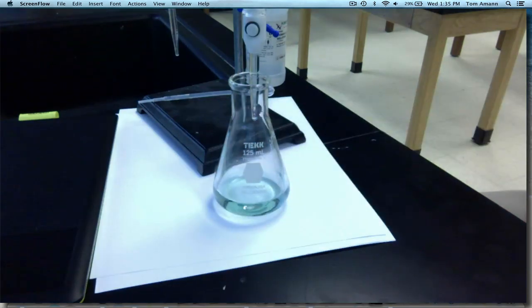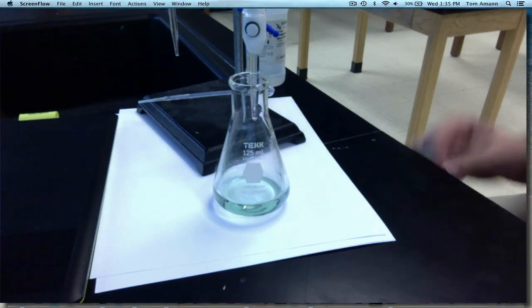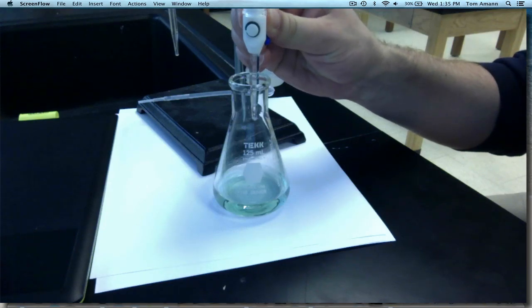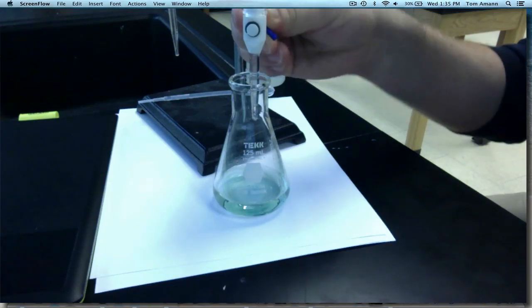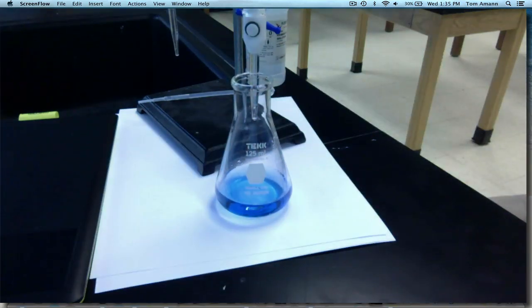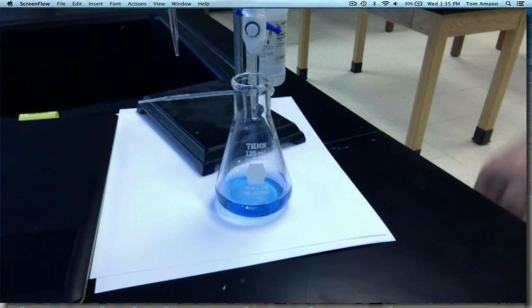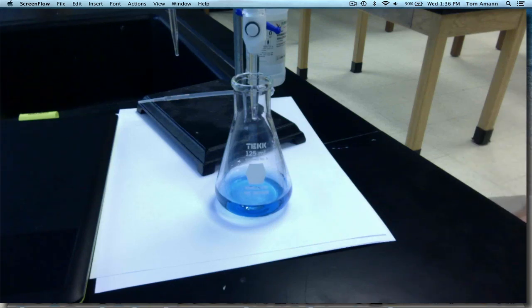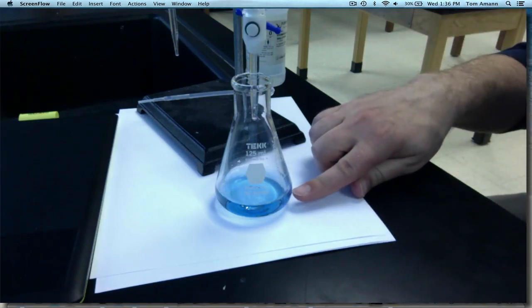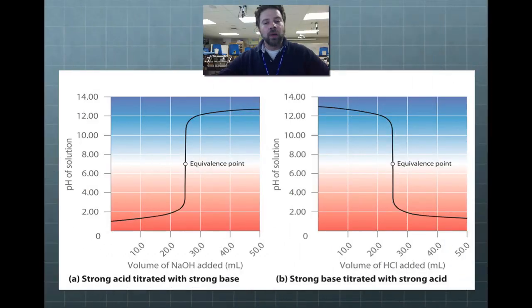With one more drop and a swirl, we see a nice sapphire blue — but actually it jumped back to green, so maybe that green was the equivalence point. Adding one final drop and swirling, it turns blue and holds. The last drop before this would be the point at which I record the volume, subtract the initial volume, and that gives me the amount it took to titrate this unknown concentration of acid.